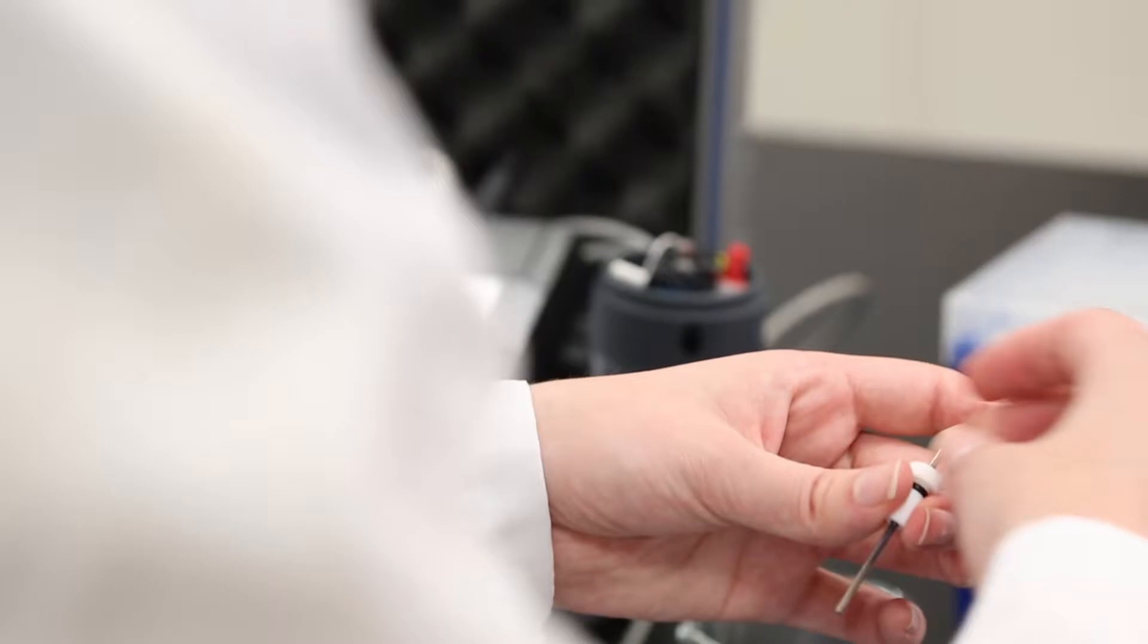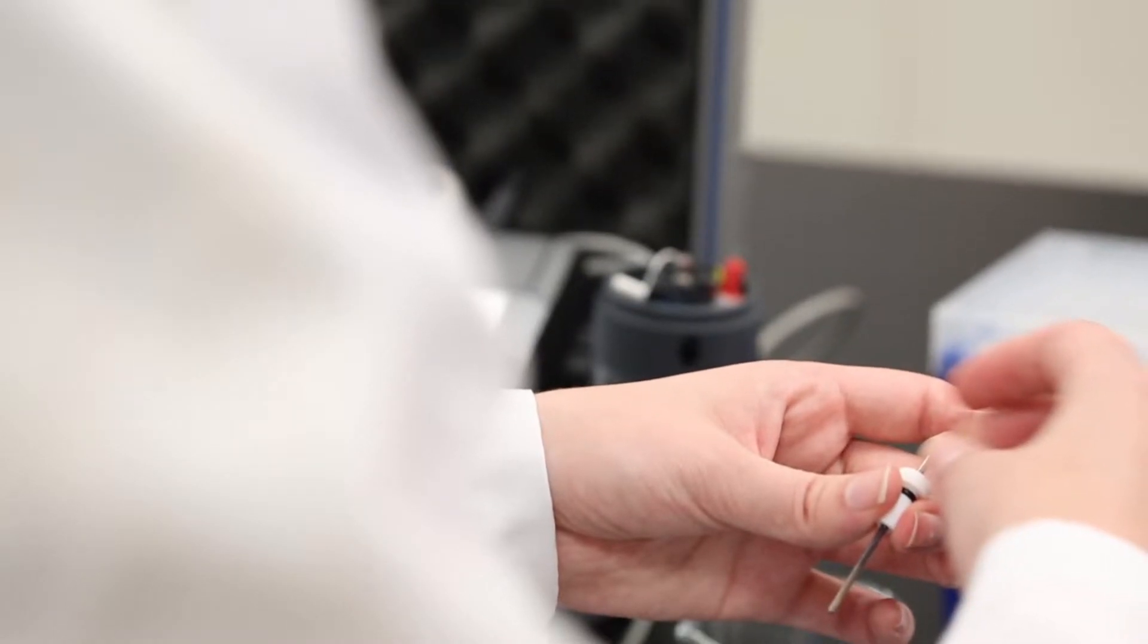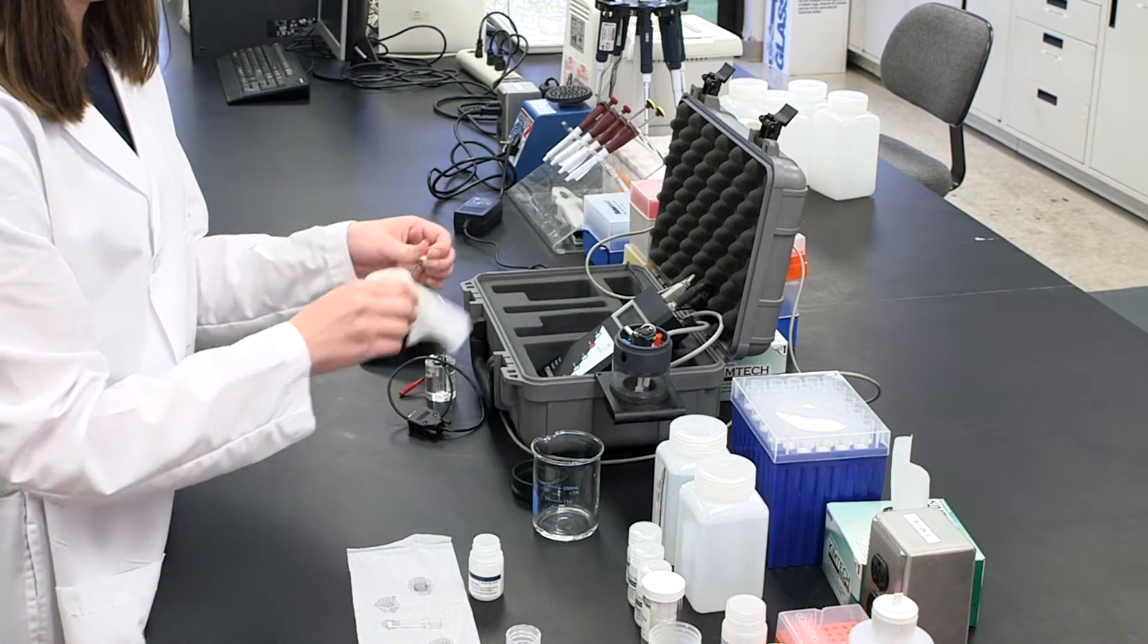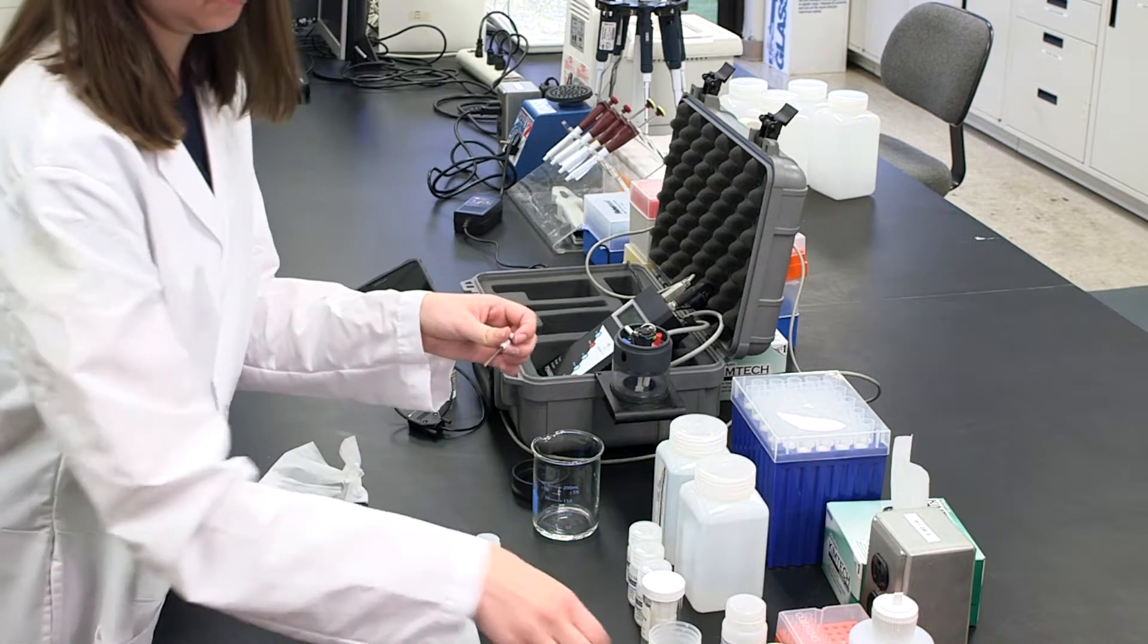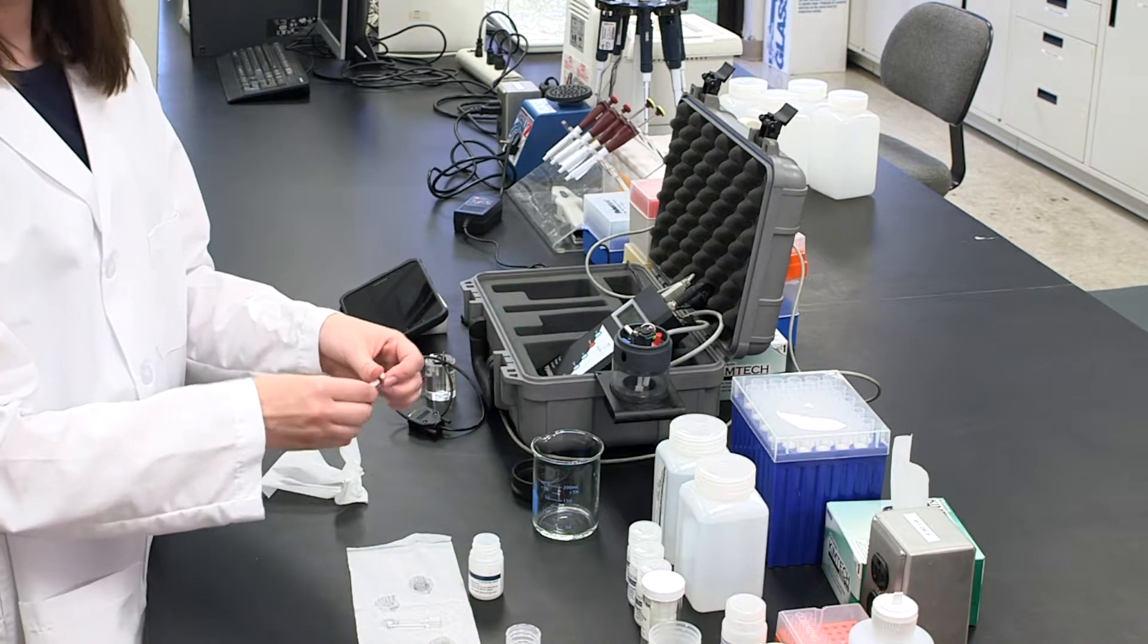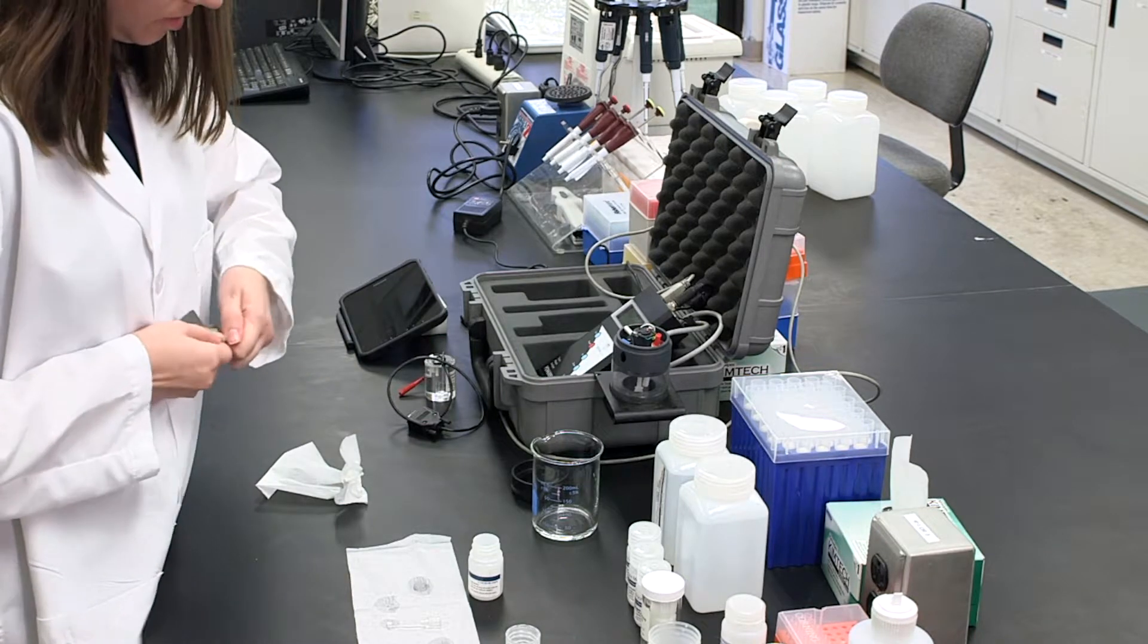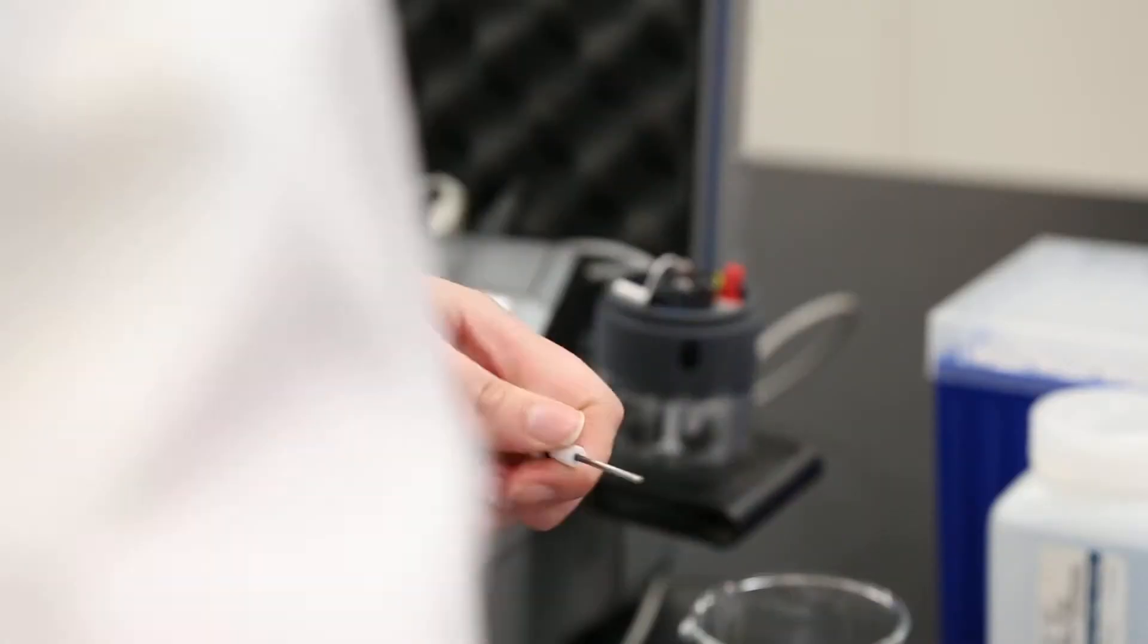When in use, check the condition of the plated silver electrode daily, as this component is critical to the correct operation of the system. If there are light patches or the plating is flaking off, then the silver rod should be cleaned back to shiny metal with the fine abrasive provided in the electrode care kit. It must then be replated as described in the PDV manual.